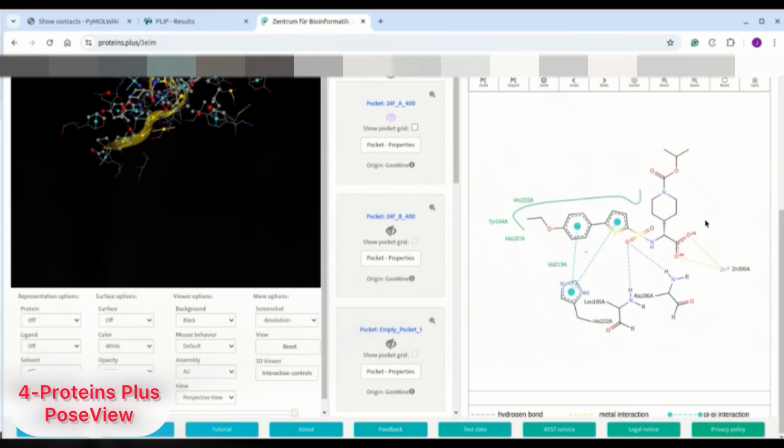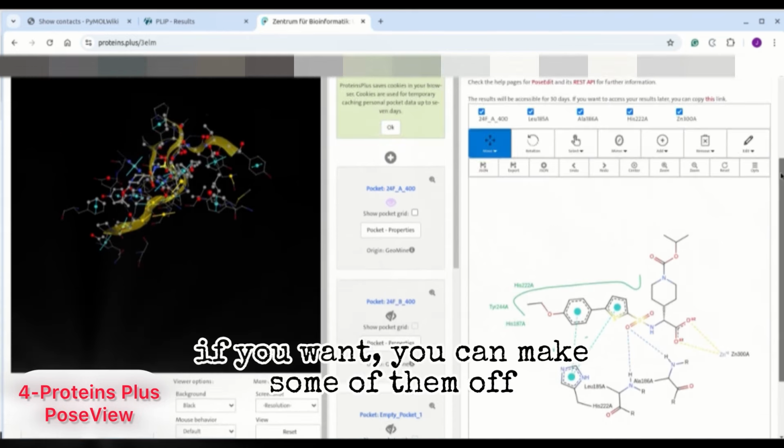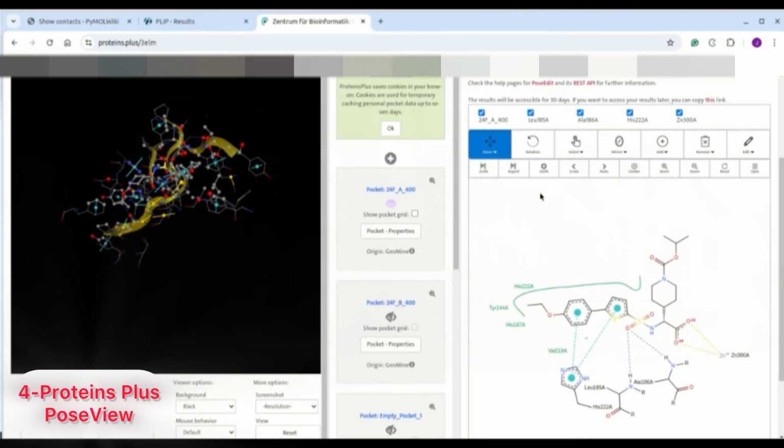So you can, if you want, make some of them.